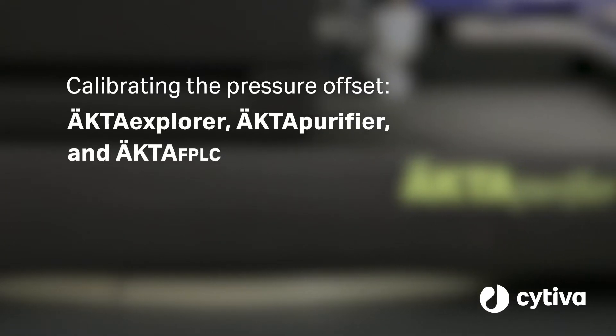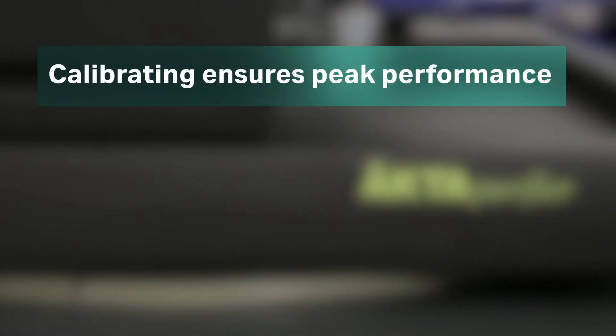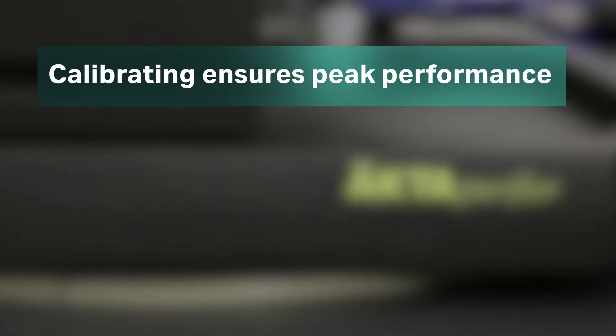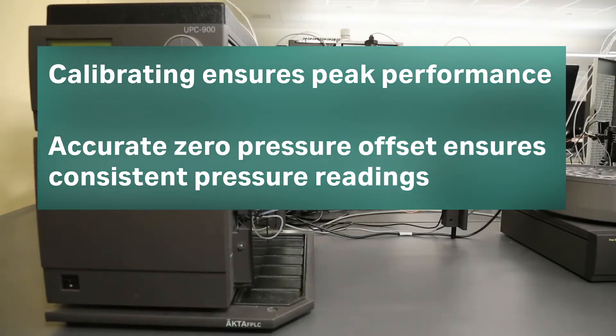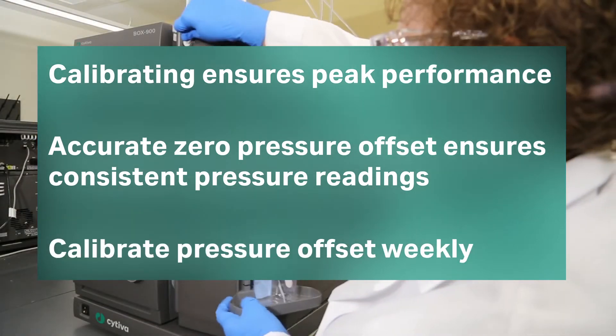Calibrating the zero pressure offset on your ECTA system is a vital part of maintaining your instrument to ensure it is operating at peak performance. An accurate zero pressure offset is necessary for precise and consistent pressure readings. It is good practice to calibrate the pressure offset weekly.